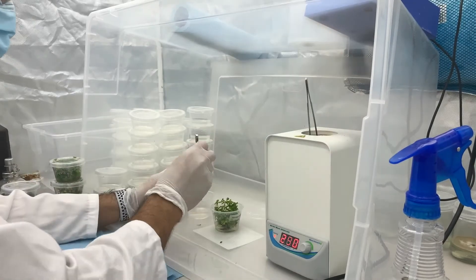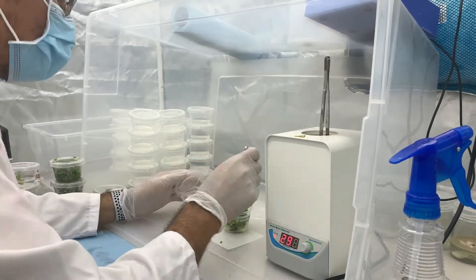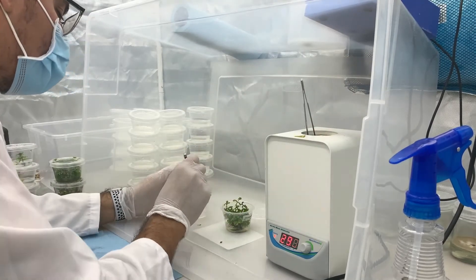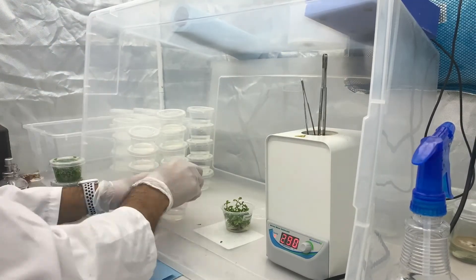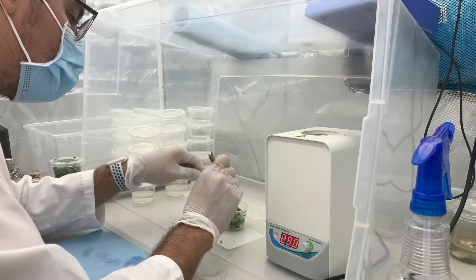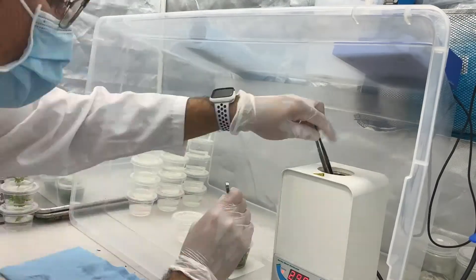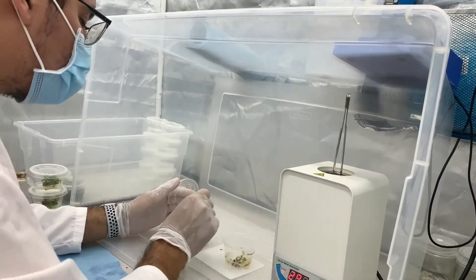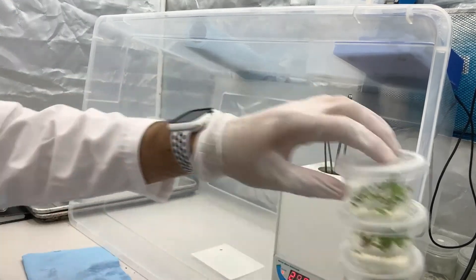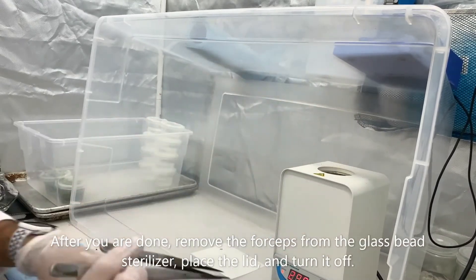Here we go. After you're finished, remove the forceps from the glass bead sterilizer, place the lid and turn it off. You're all done!